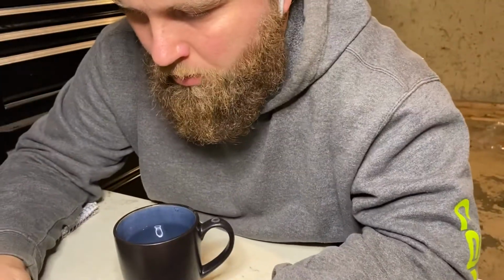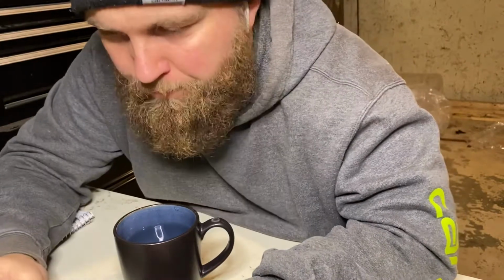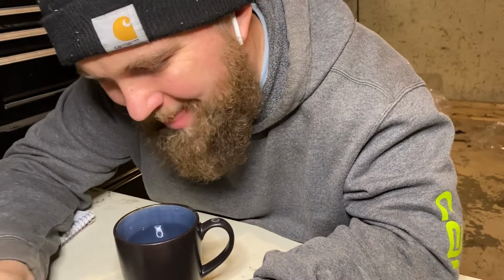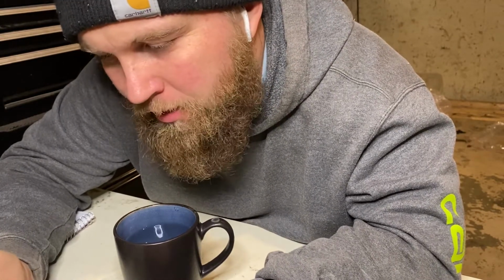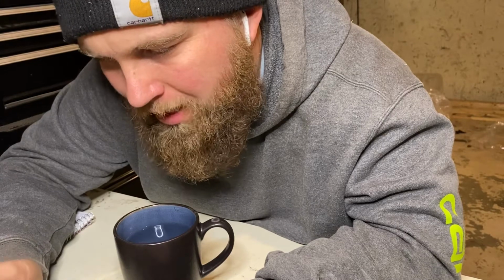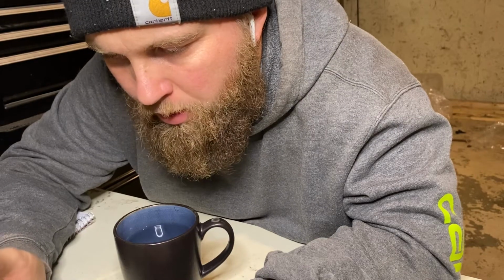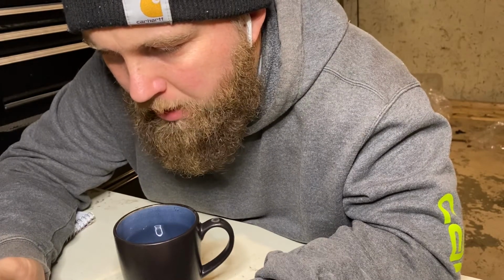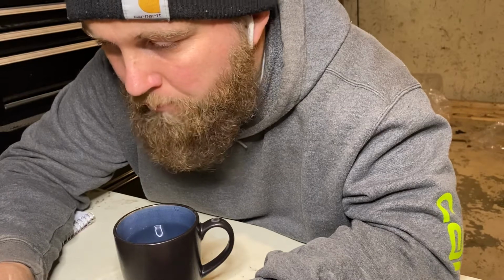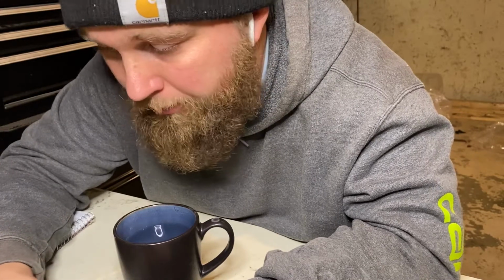Now, on to the pH test. Again, back to the instructions, because I'm one of those rare people who actually reads the instructions. pH. Test procedure. Dip one strip into water sample for 10 seconds without any motion. Remove, wait 15 seconds, then match with closest color. Results may not be accurate if sample total alkalinity is below 80 ppm. Well, you didn't give me an alkalinity test, so.